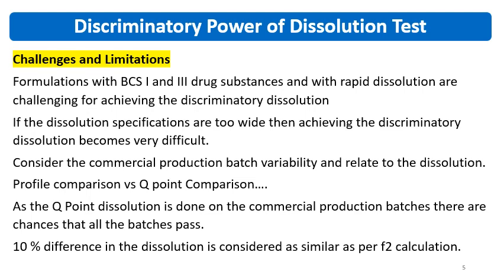Also, if you work on 6 units and you show the discrimination that the dissolution method has a power to discriminate the batch, then it might be sometimes wrong, because from 6 units the dissolution will go into S2 stage with 12 units in the commercial batches, and then if still it fails, it will go into S3 and there it will pass.